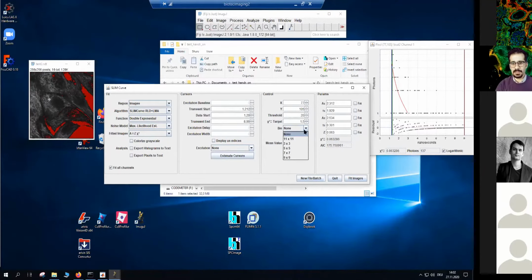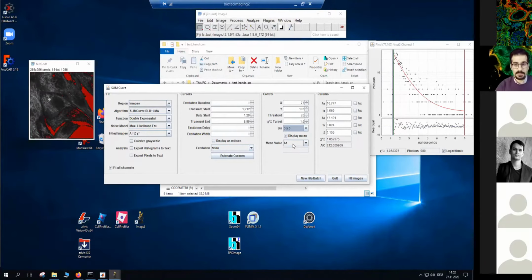One thing that I can do is the binning, and that's the Becker and Hickl binning. As far as I can say, this is supposed not to change the spatial resolution in your image. It doesn't bin actual pixels with each other, but it bins the lifetime information of the neighboring pixels together. So it's a kind of smoothing in the lifetime data, but we keep the actual spatial size of the pixels as acquired. Later, when we overlay the lifetime data on the confocal or multi-photon intensity images that we acquire in the beginning, the spatial resolution does not drop drastically.